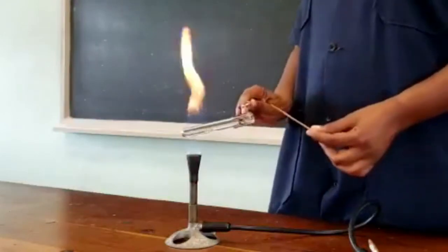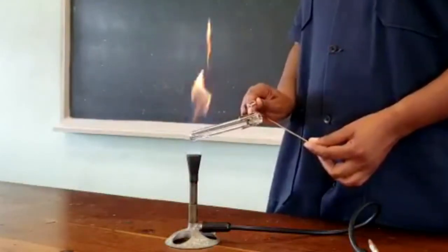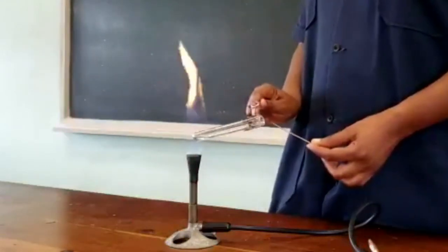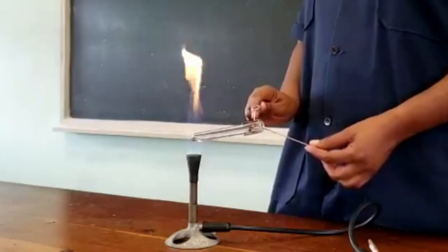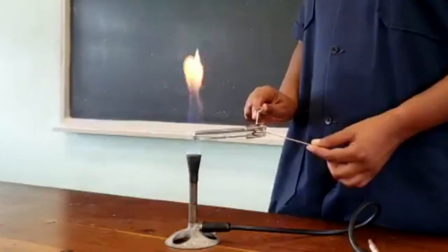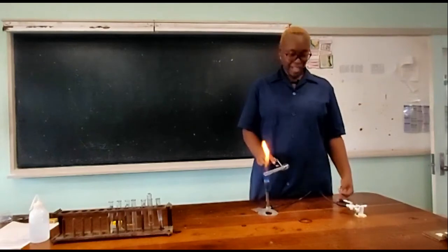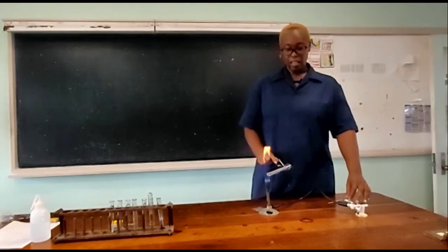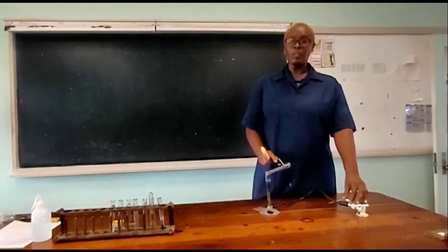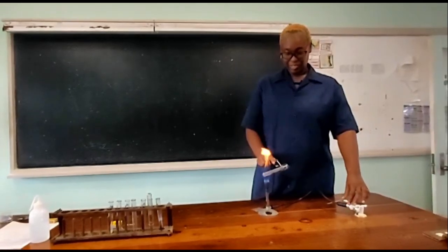And here we have right near the mouth of the tube, my glowing splint still continues to glow. And so that indicates to me my glowing splint hasn't been put out. What does that indicate? The fact that my glowing splint is not put out indicates that you should know what gas is being given off.